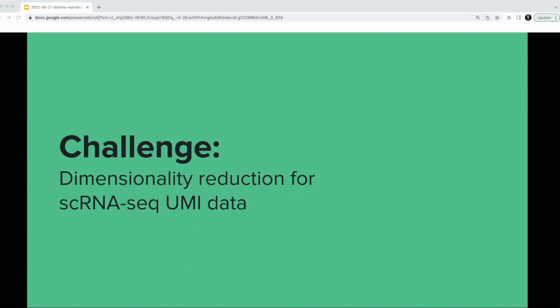Hey, Stephanie, actually there is a question. I think one question is asking about the UMAP data of the brain that you showed earlier, with 1.3 million cells. How long does your software take to plot that? How long does it take to calculate PCA, or to plot the UMAP? I think the question is how long does it take to compute the principal components?